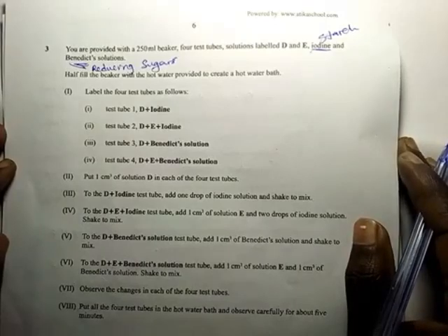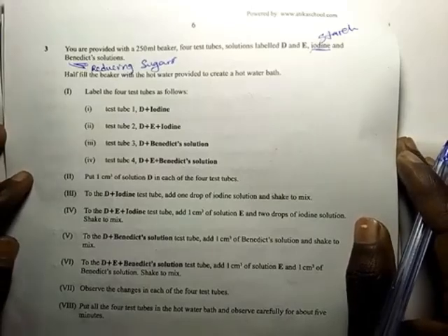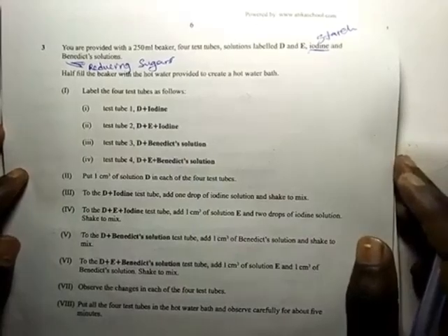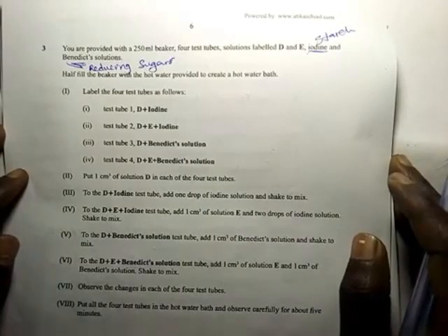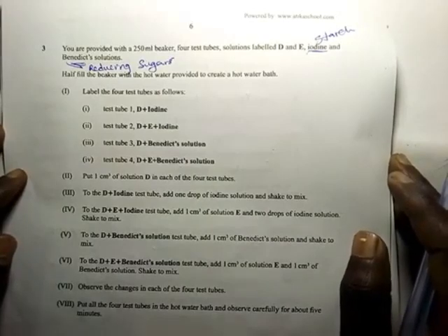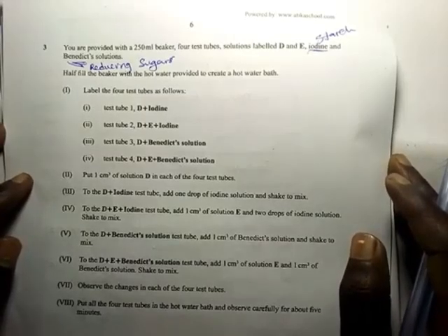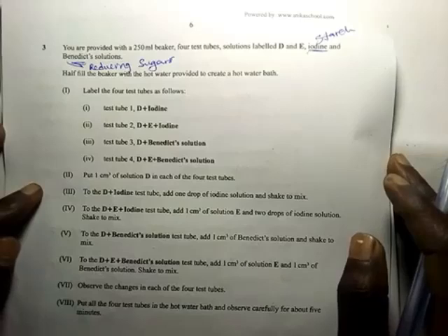Now 1. Label the 4 test tubes as follows. Test tube 1, D plus iodine solution, that is solution D and iodine solution. Roman 2, test tube 2, solution D plus solution E plus iodine solution. And Roman 3, test tube 3, solution D plus Benedict solution. And Roman 4, test tube 4, solution D plus solution E plus Benedict solution.